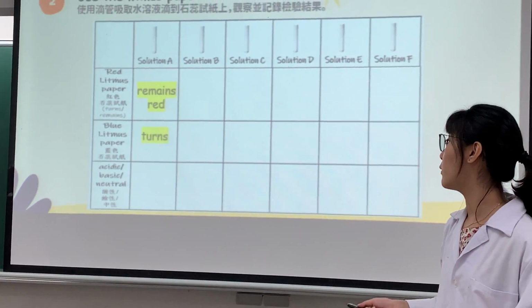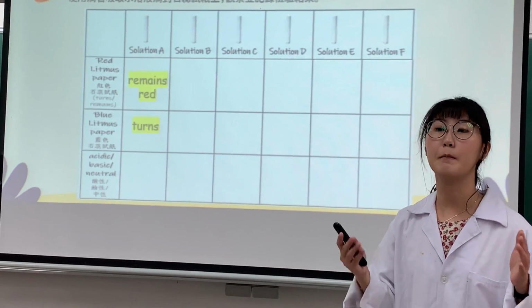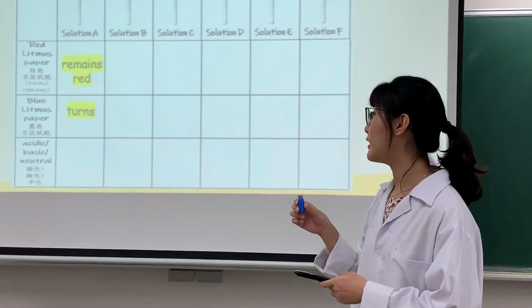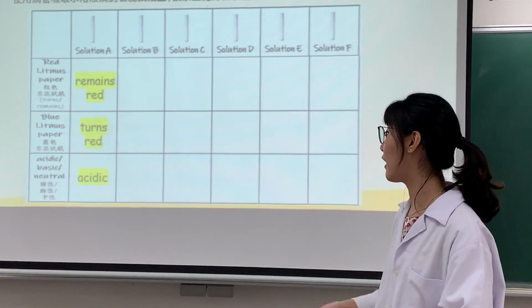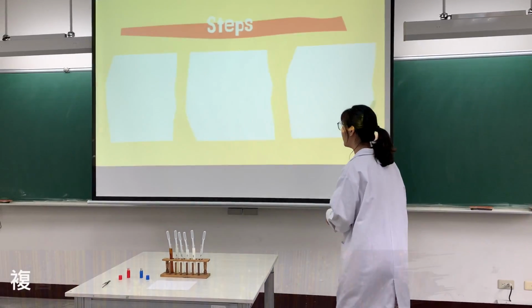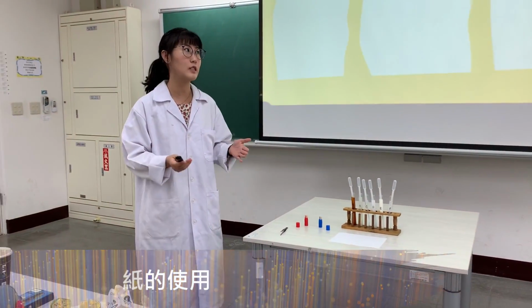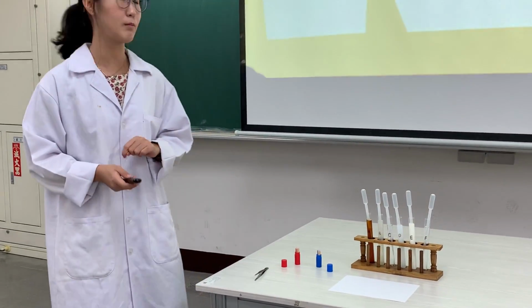And number 2, we're going to use the blue litmus paper. And I want you to write down the result. So number 3, I want you to write down the result. 告诉我它是 acidic, basic 还是 neutral. Now, we're going to do a quick review. 我们要快速复习一下怎么使用石蕊试纸. So how to use the litmus paper?